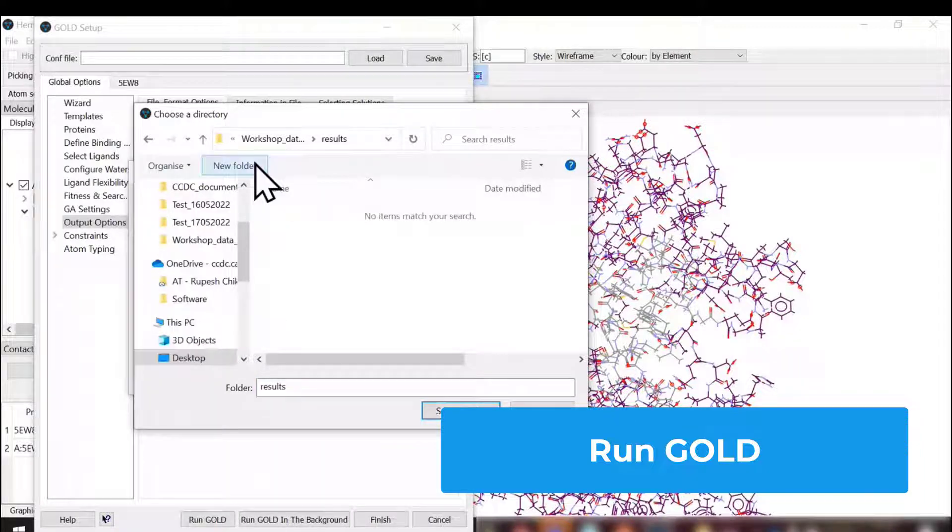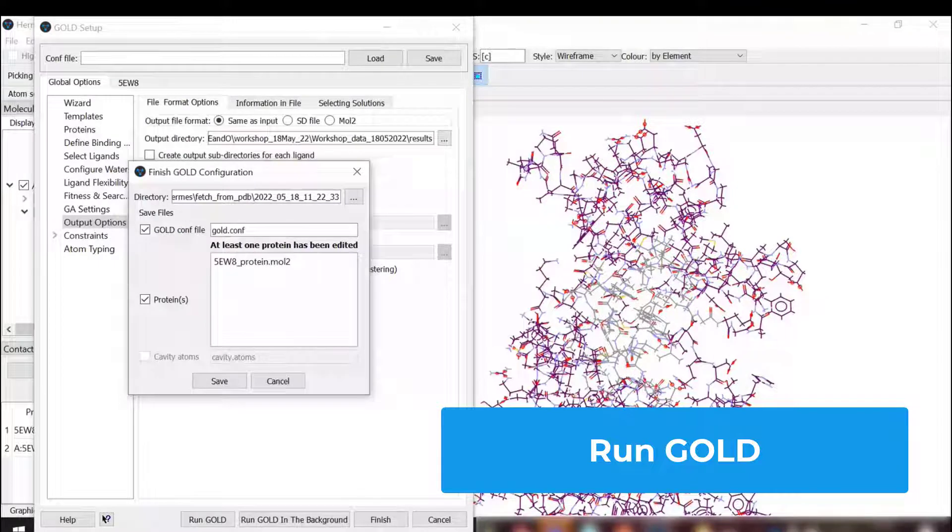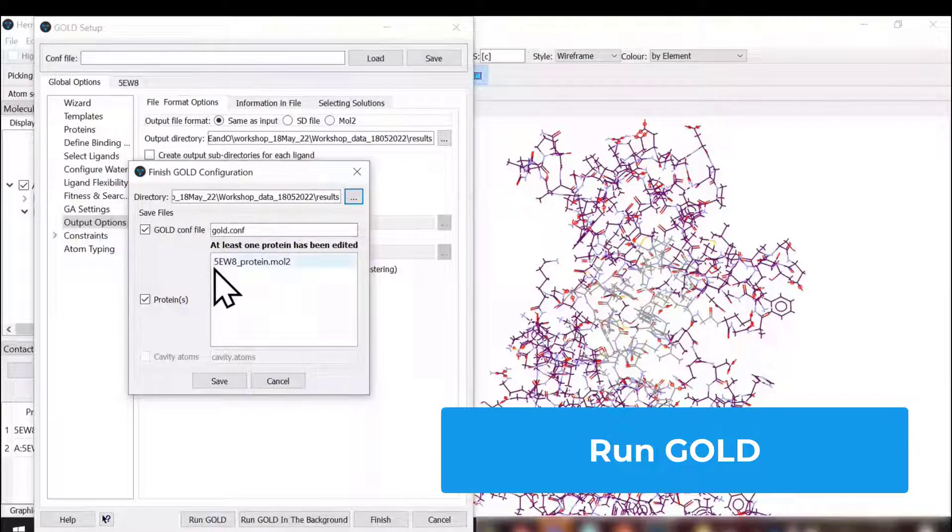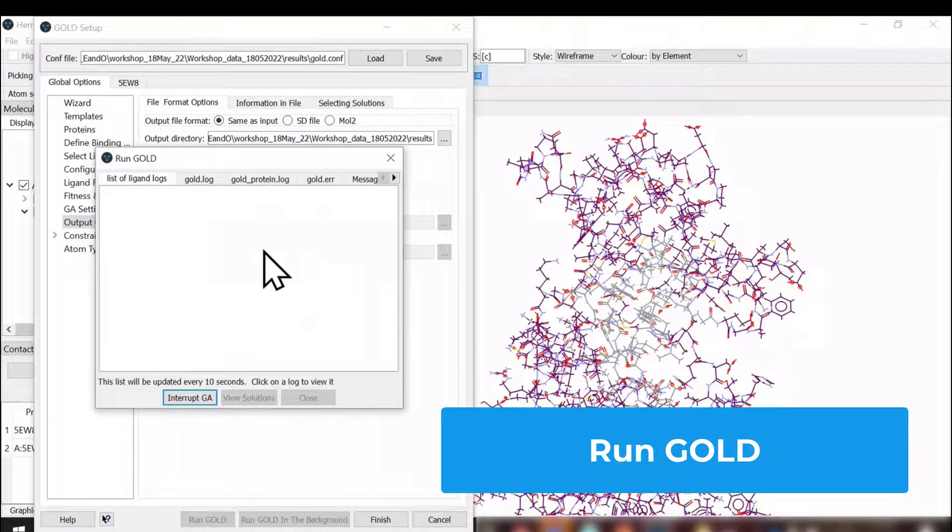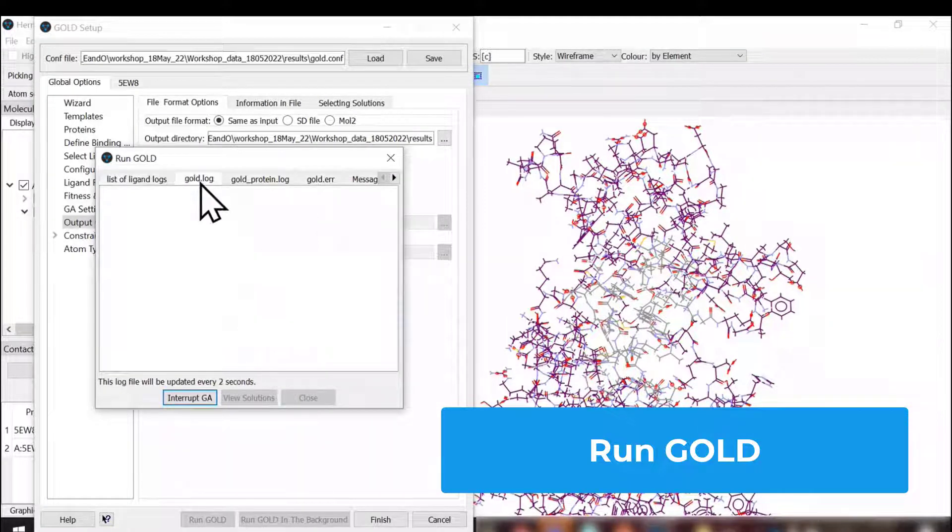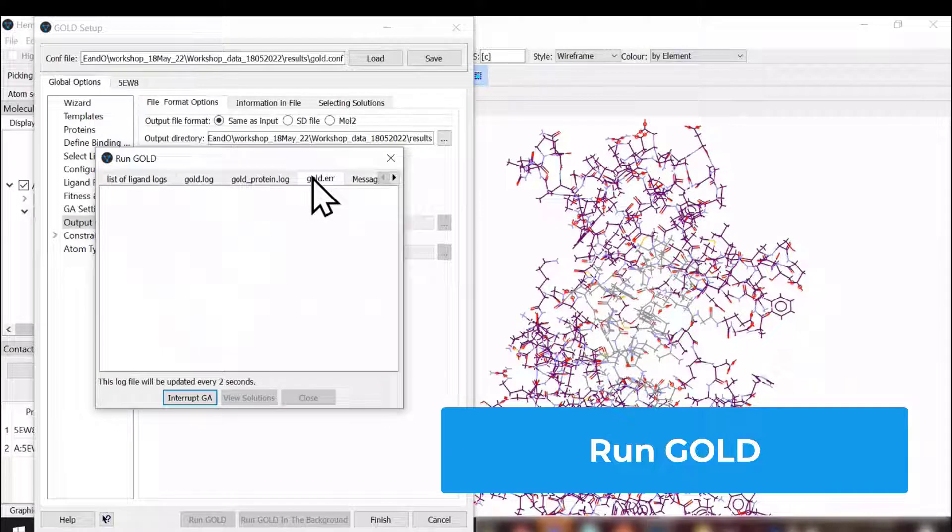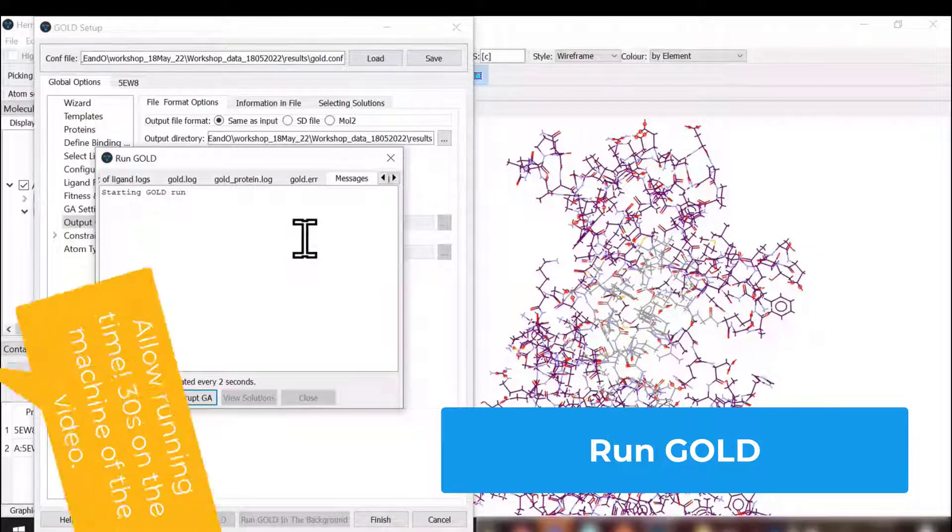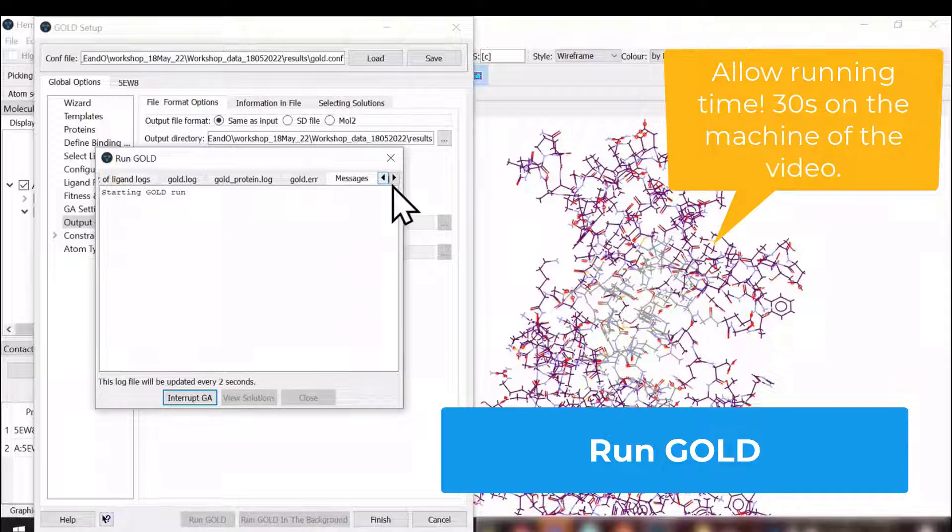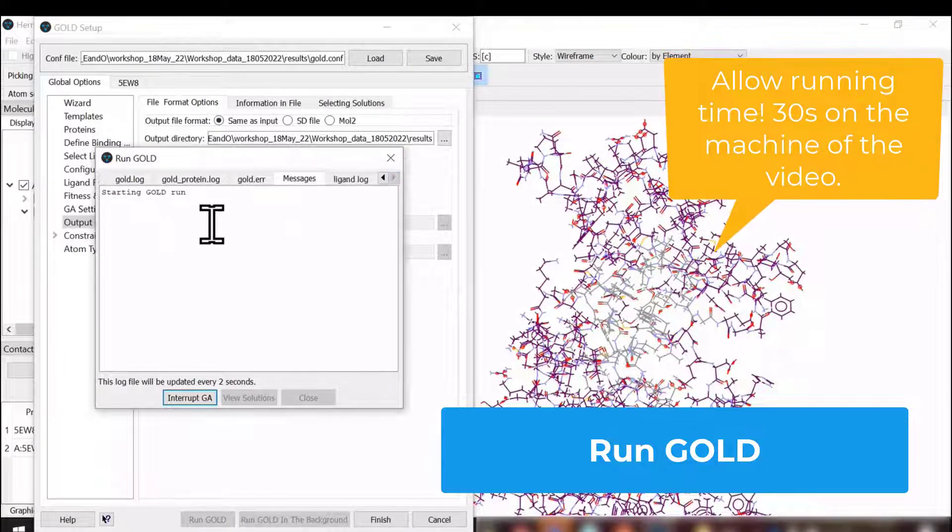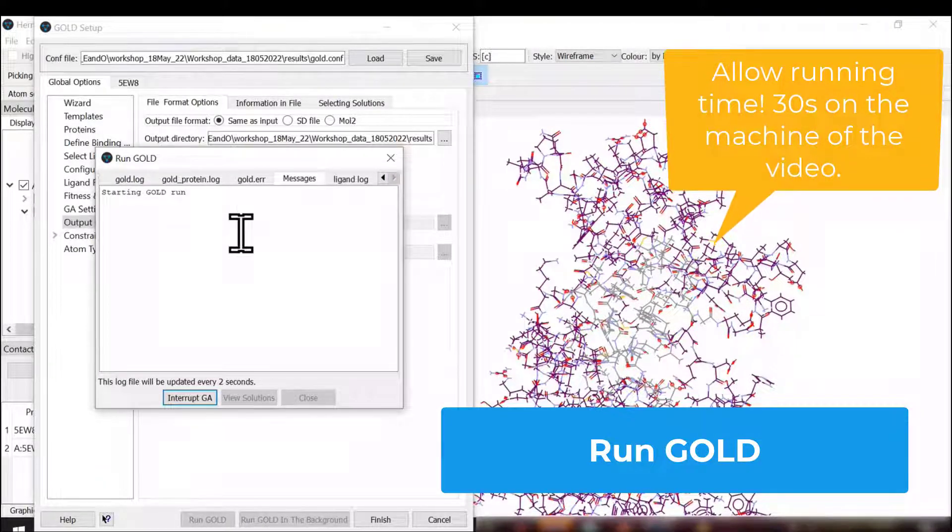We're going to select the results folder that we created and save. Once you click the save button, it has launched the calculation. It says starting GOLD run, and the docking has started here.